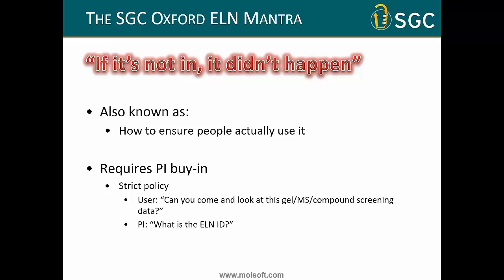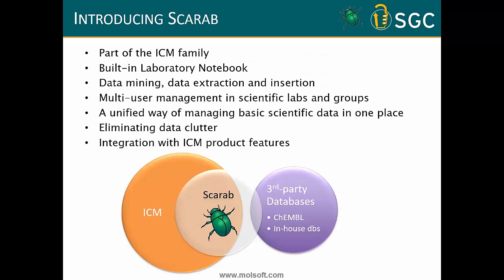And that's a really critical buy-in. You could have a wonderful LIMS platform that does everything you need to do, but if you don't have a way of forcing people to actually put it in and get them to see the benefits of doing that culturally, then it's a bit of a white elephant. So having said all that, those are the things that we wanted to do, the things that we have done, and now I'm going to talk a little bit about how we have developed Scarab in conjunction with ICM and some of the features that cover some of the aspects that I have mentioned in some detail, and hopefully show you some demos that everything works okay, but let's see how it goes.